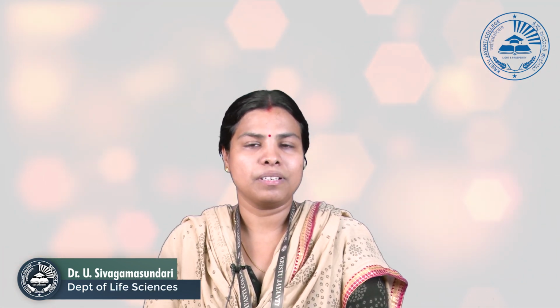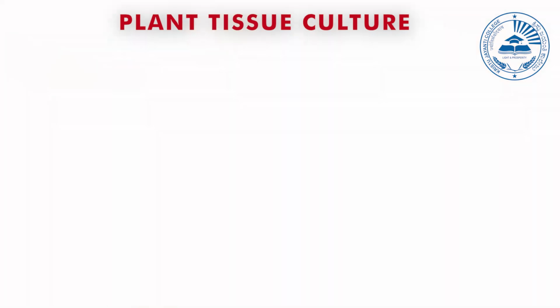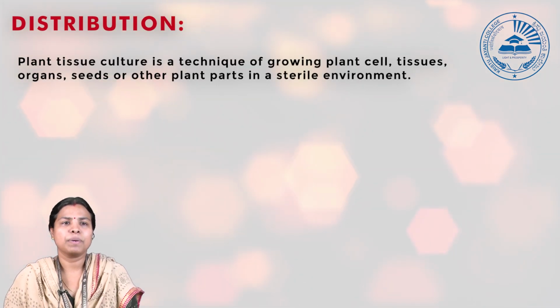So in this video, it will tell you about the basics of plant tissue culture. So without further delay, we'll move on to the definition of plant tissue culture. What do you mean by plant tissue culture?